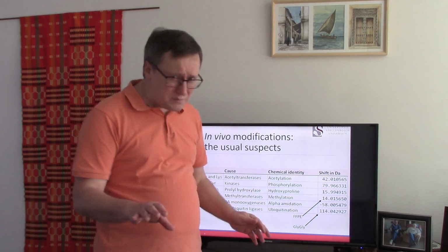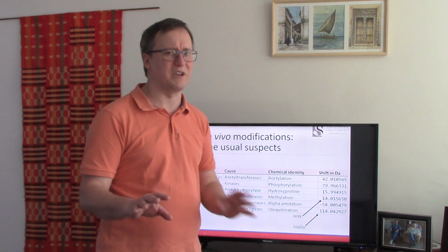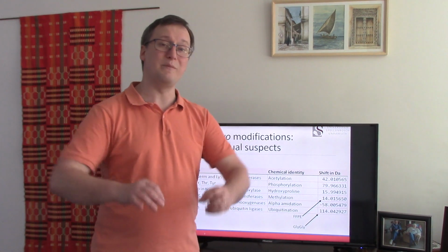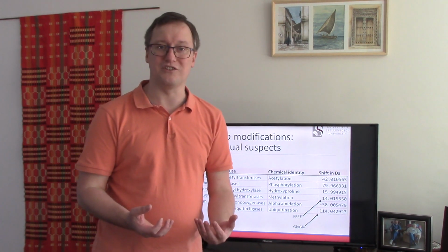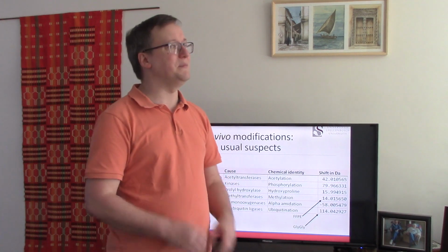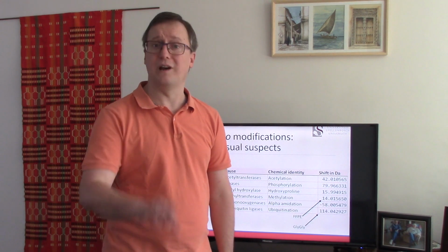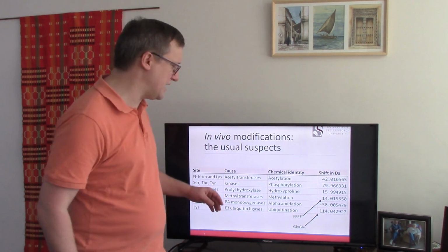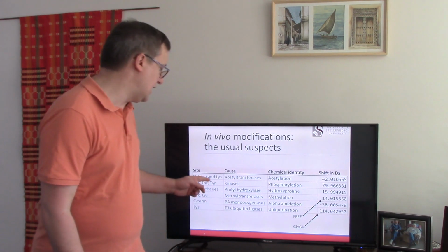Of course, most people who are doing post-translational modification searches are not just trying to deduce something about their chemistry, they're trying to learn about the biology of the sample and the post-translational modifications that it contained. And here you might be tempted to say, oh, here he's going to rattle on and on about phosphorylation. I already did that, so I'm not going to repeat that here. I would note, however, that acetylation is a very big deal.